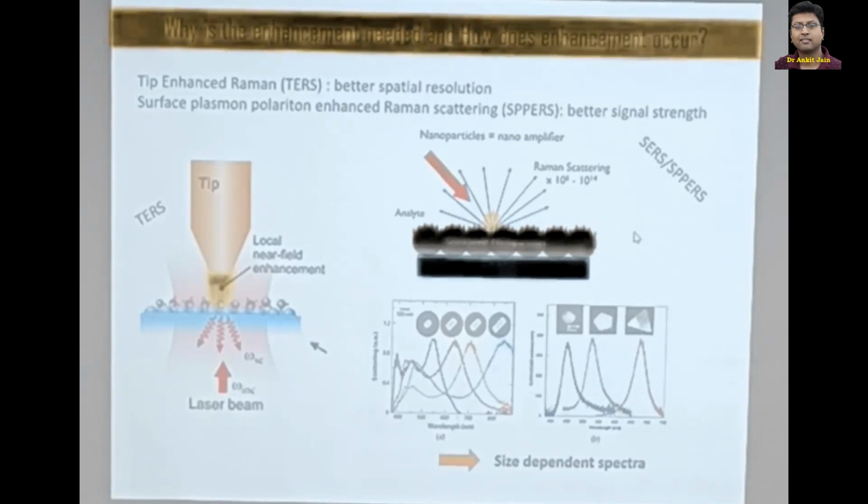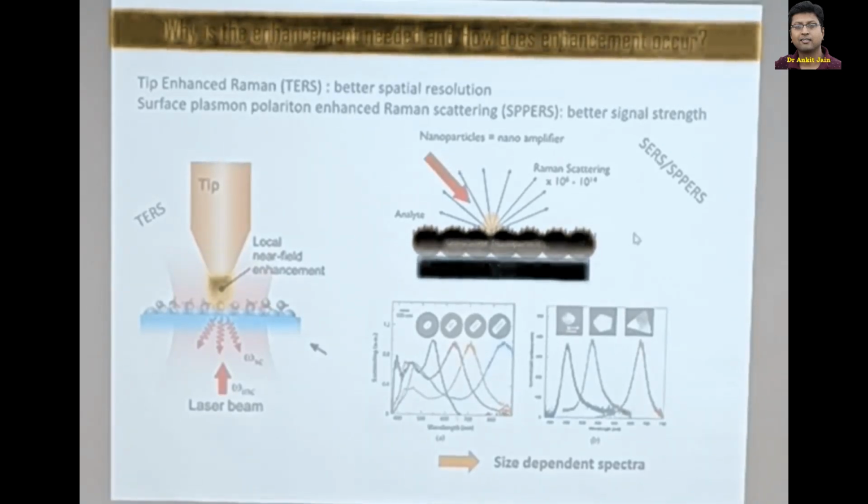So you can play with the substrate, you can play with the laser wavelength, you can play with your incoming laser light method, that is by a tip, and you can increase these intensities that are going onto the sample or the response of the sample. So these two parameters you can play with.